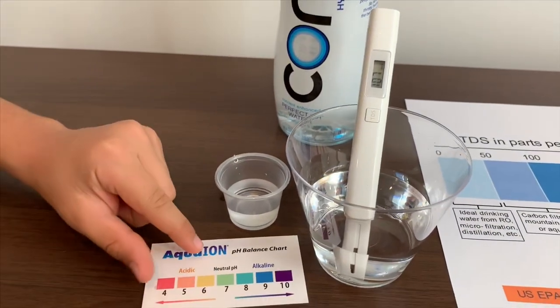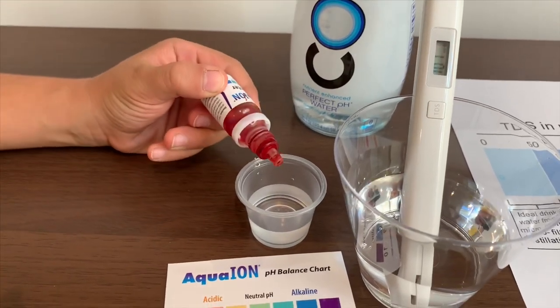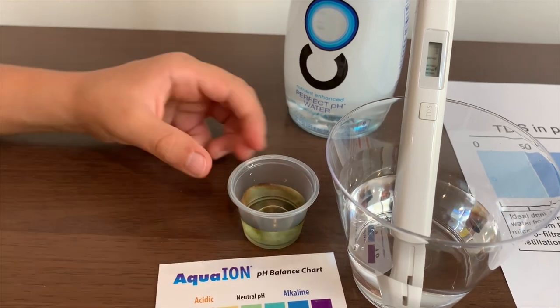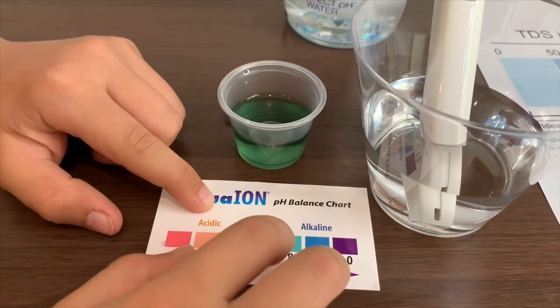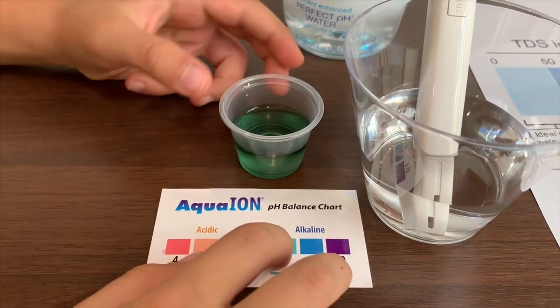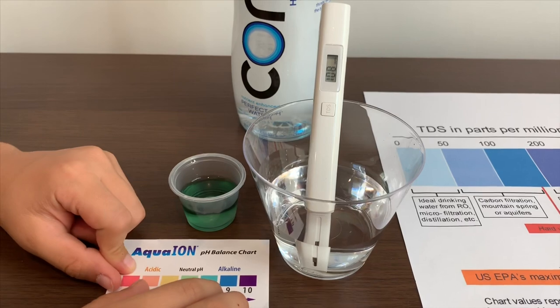Now let's test the pH. Make sure you only do two drops. This is about 7.4 to 7.5, so that means it is at its usual pH.